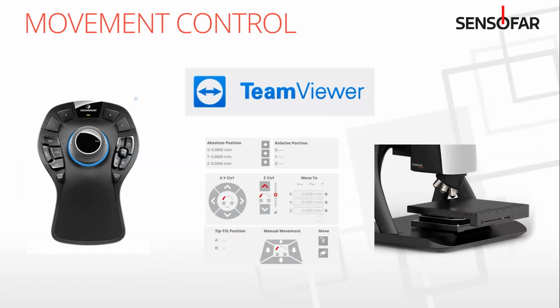Lastly, we also have the option for a motorized tip tilt. So if you've got samples that are really flat and you want to measure them quickly, you can one button click and the stage will actually tilt itself into perfect level. Or let's say you've got a flank or an undercut that isn't really visible, you can manually tilt the stage up into a different position to make that more easily scanned.